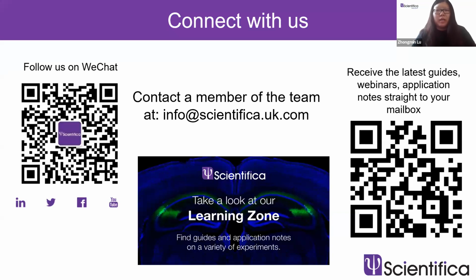But the success rate depends on your practice, right? We usually say that if you can get over 50% success, with a really nice high quality cranial window within a month, you are already an expert. I have some tips to share, so please feel free to reach out to me. If you don't feel comfortable talking about it here, we can discuss that in private.